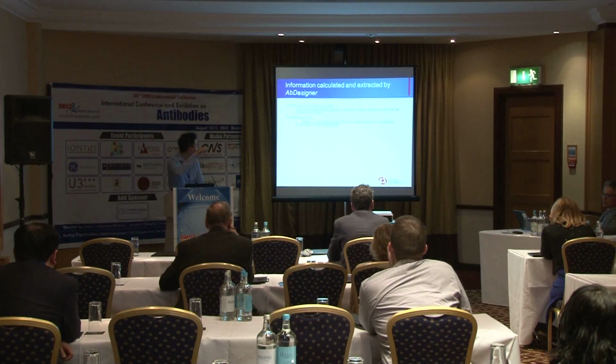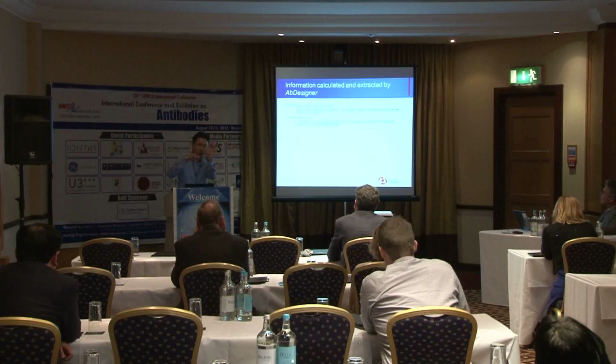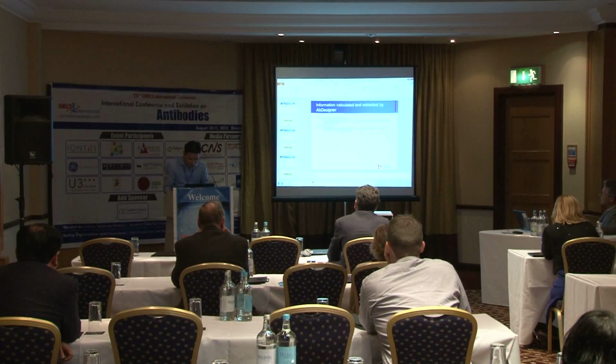Another very useful feature tells you the uniqueness of each region along the sequence. So we call it the uniqueness score. Okay, so let me demonstrate that.